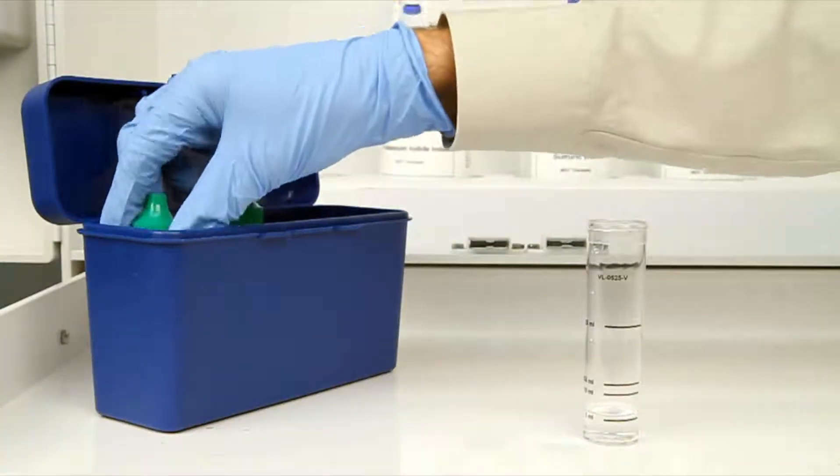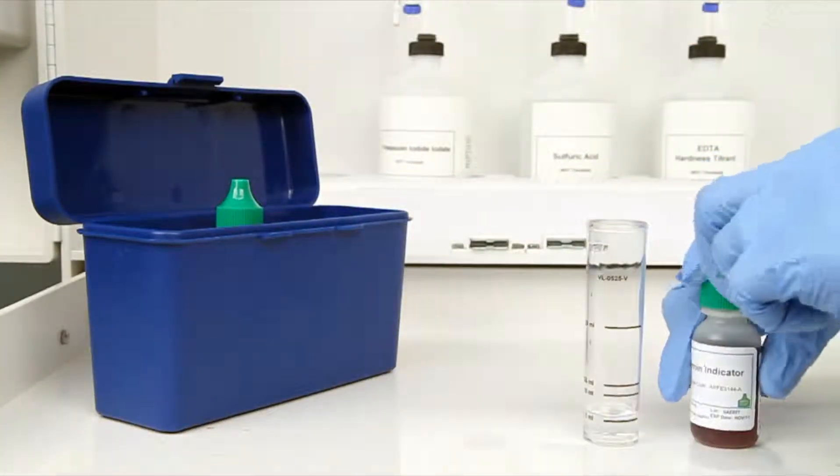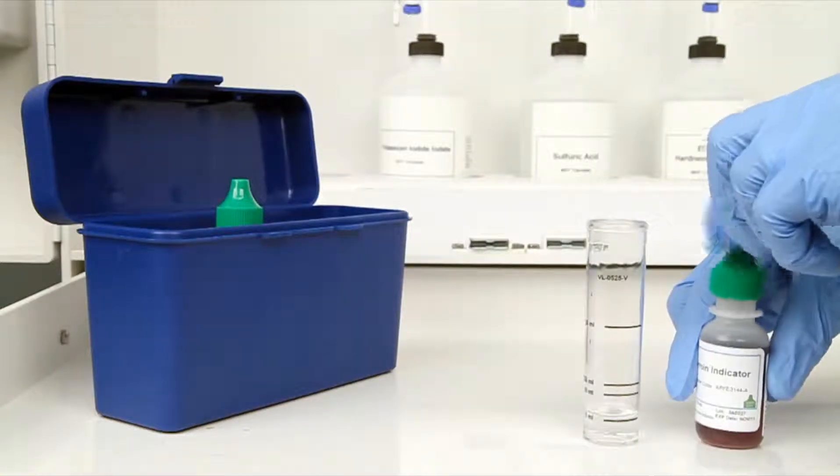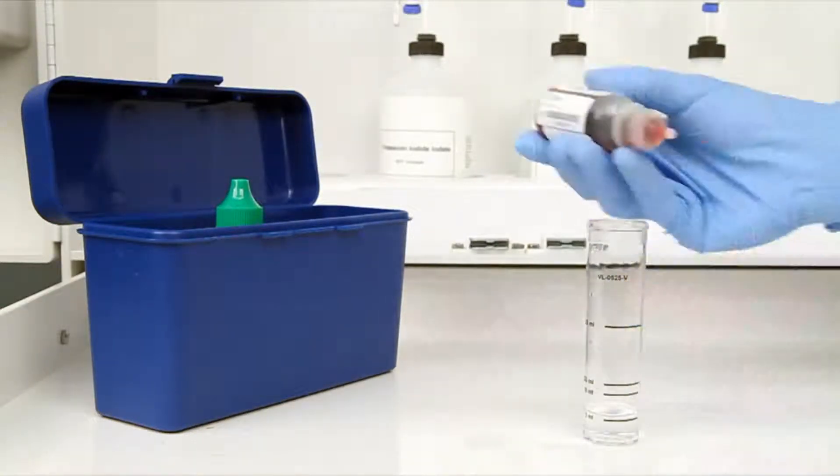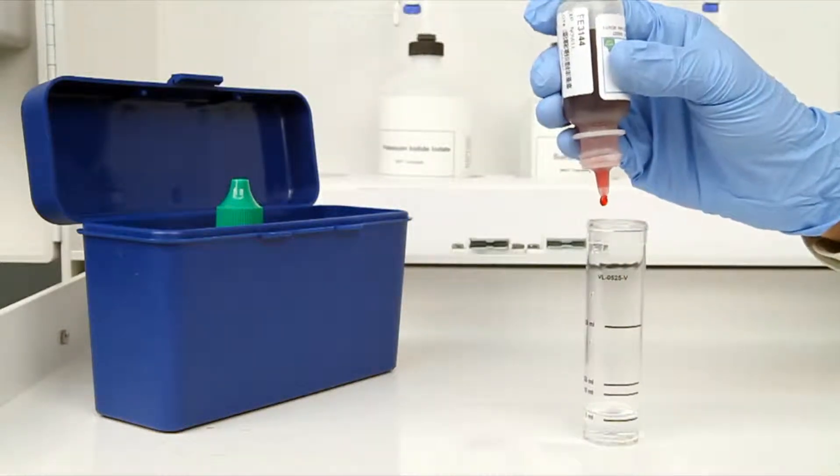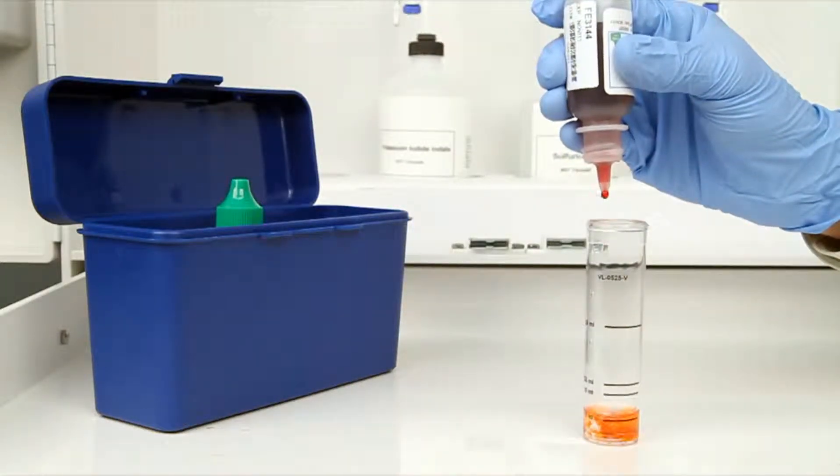The next step according to the endpoint ID procedure is to add eight drops of ferroin indicator. The bottle contains a dropper tip, so it's important to hold the bottle vertically to get a consistent drop size.